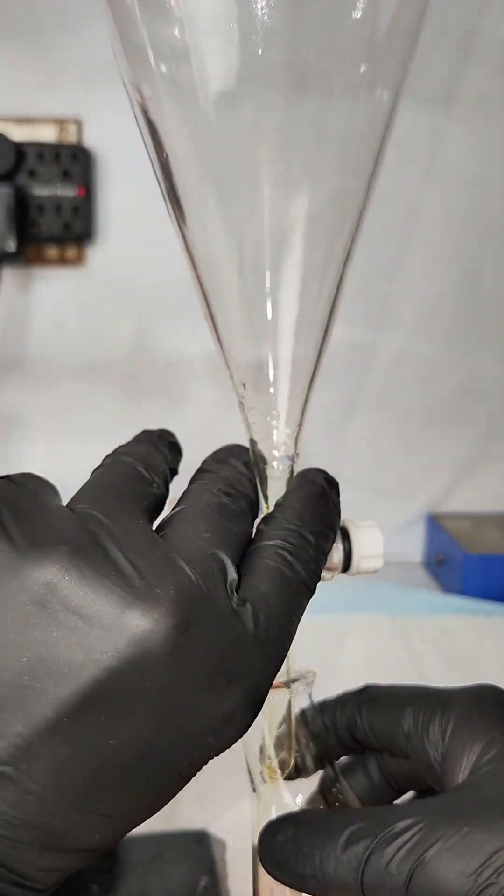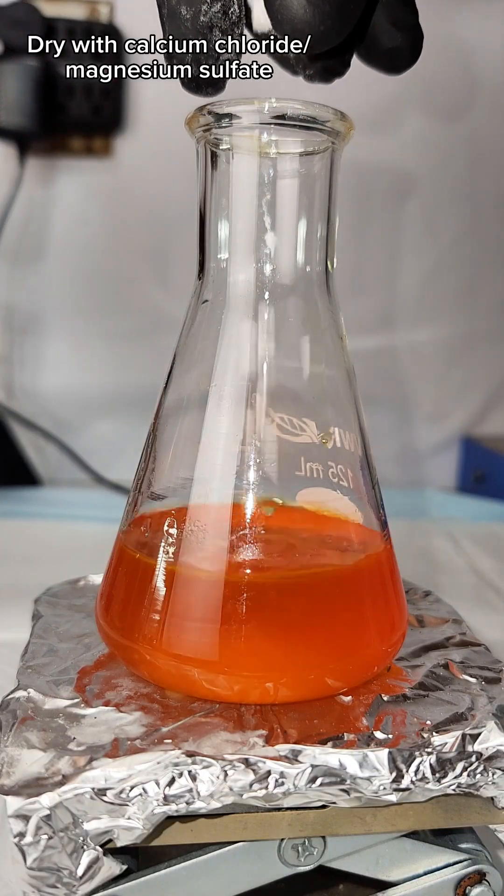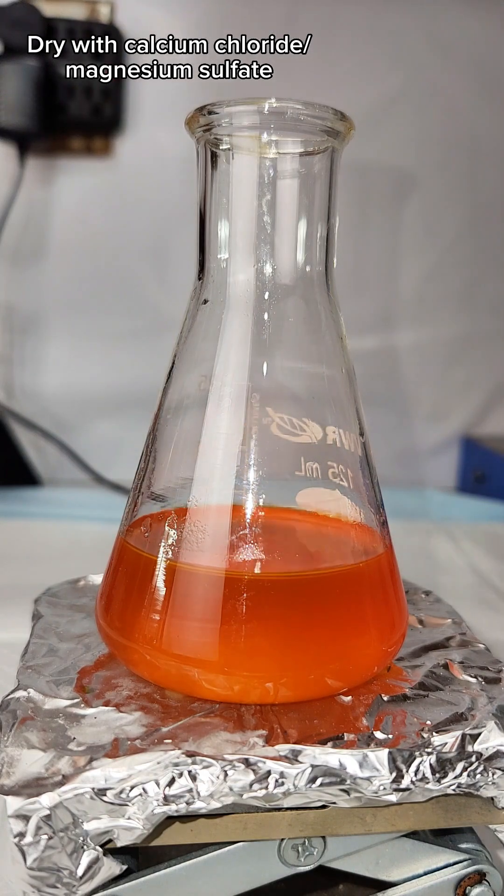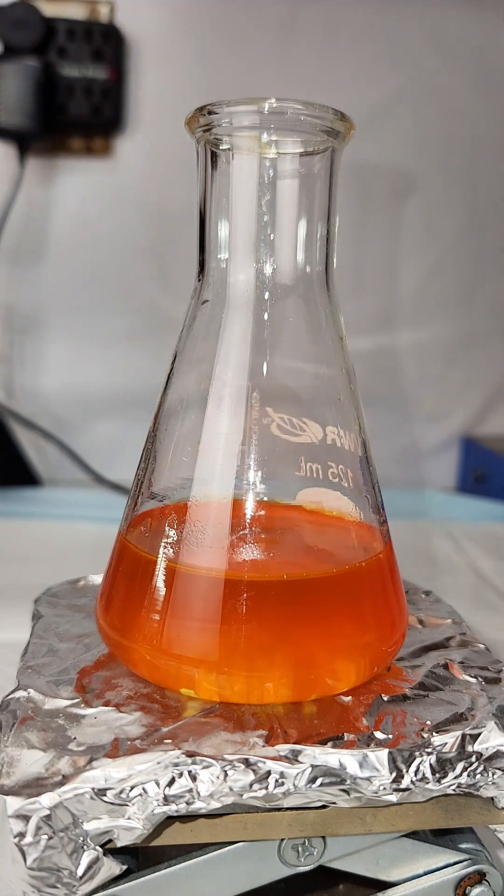The amount I added was pretty arbitrary, but after I dump it in and give the flask a little swirl, you can see the benzene immediately clear up as the excess water is absorbed.